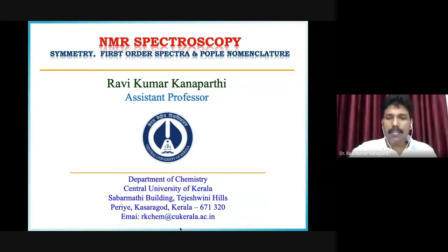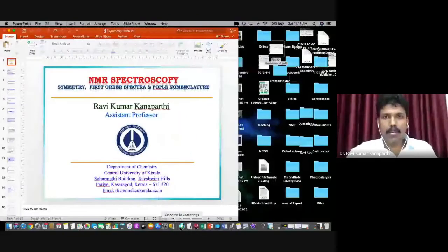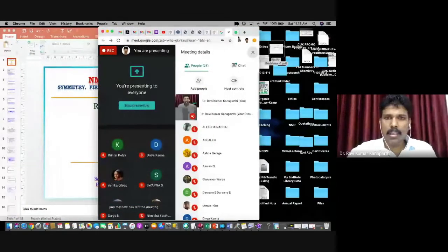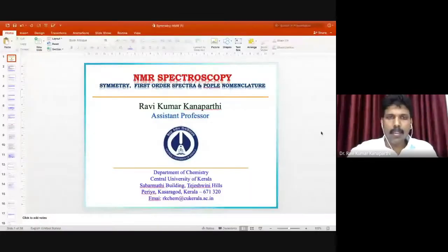And then followed by that, there is another topic. We'll also study the nomenclature of Pople notation and what its consequences are. Okay, so today we will learn three major things. One is the symmetry elements, briefly, and also the different types of NMR spectra, and also the Pople notation. And then tomorrow we will see a couple of nuclear Overhauser effects, etc.